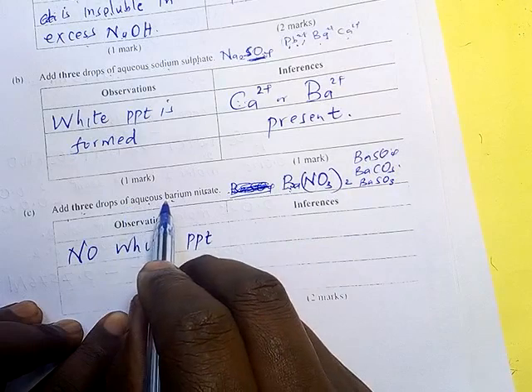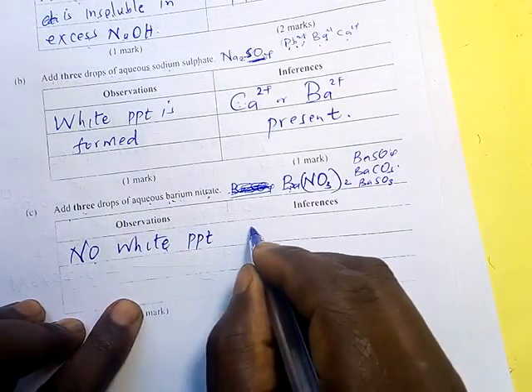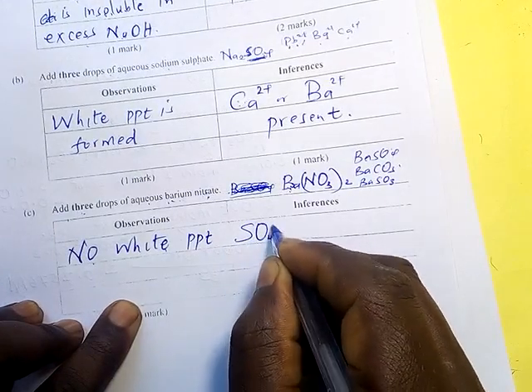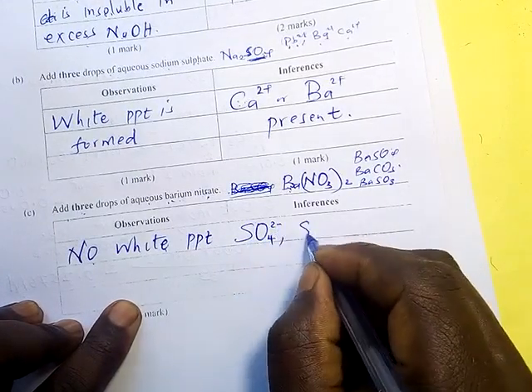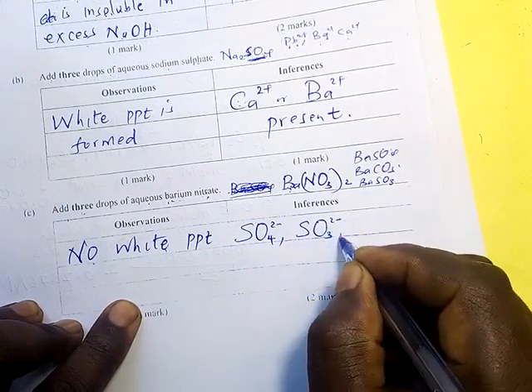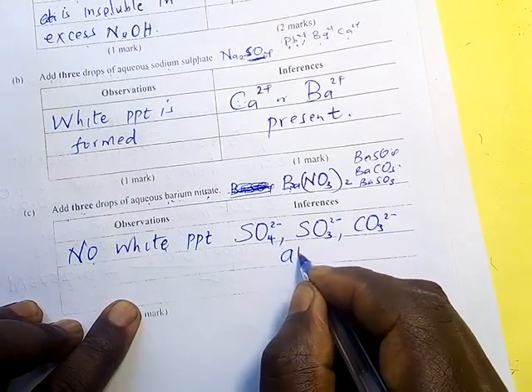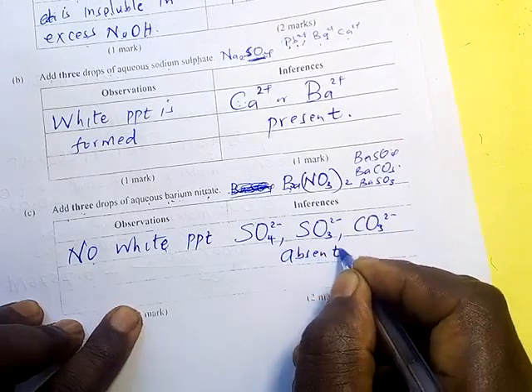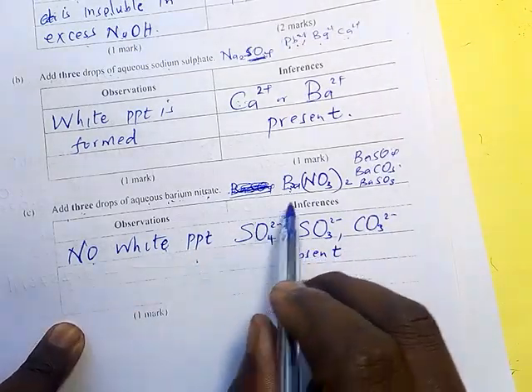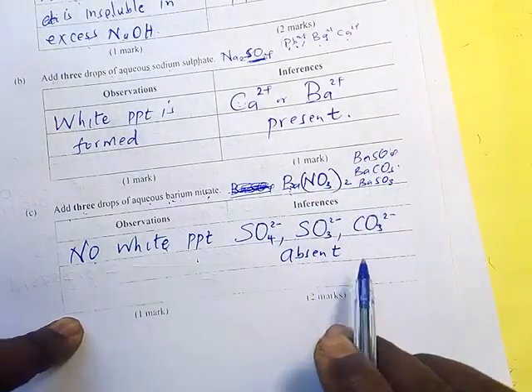But now, since there is no white precipitate, it means the sulfate, the sulfite, and the carbonate are absent. They are not there. Otherwise, if they were there, barium would form a white precipitate with any of them.